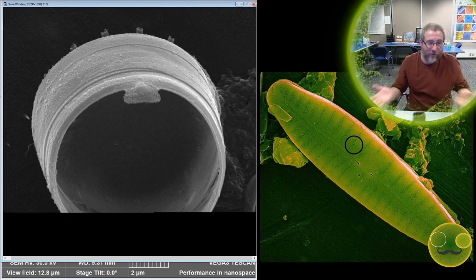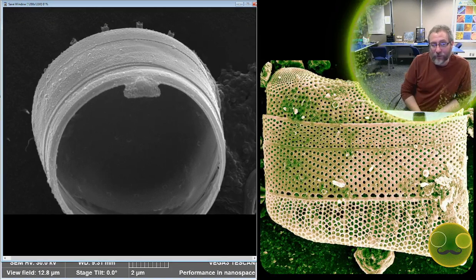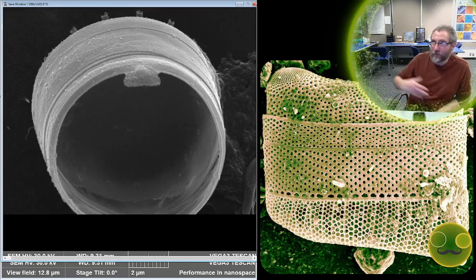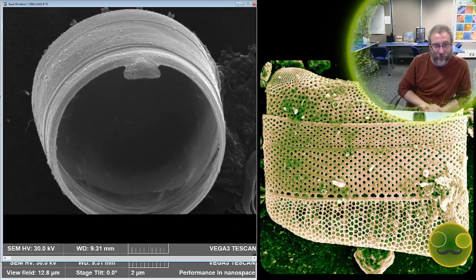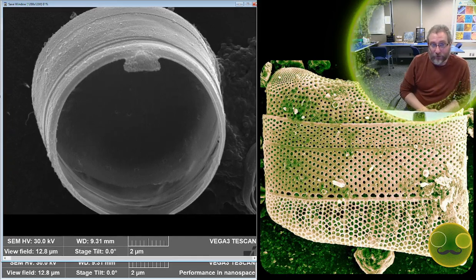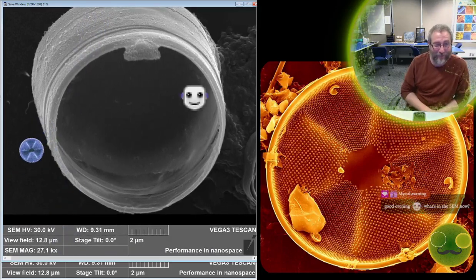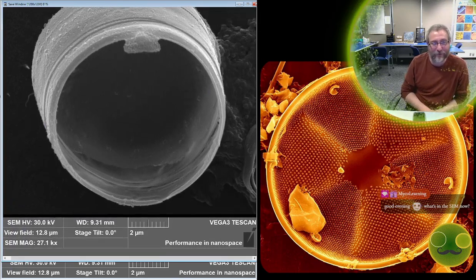A normal microscope, you see things at, at most, 1,000 times magnification. Even in some of the best microscopes, that's all you're going to see. And so it's equivalent to looking up at the stars and just seeing a dot, right? Versus being able to see an actual planet or an actual galaxy with a telescope. And it's pretty different, right? If you just looked up and you saw a dot and you're like, I guess that's Jupiter, and then you look at Jupiter in a really high powered telescope, it's a pretty different understanding of what's going on.